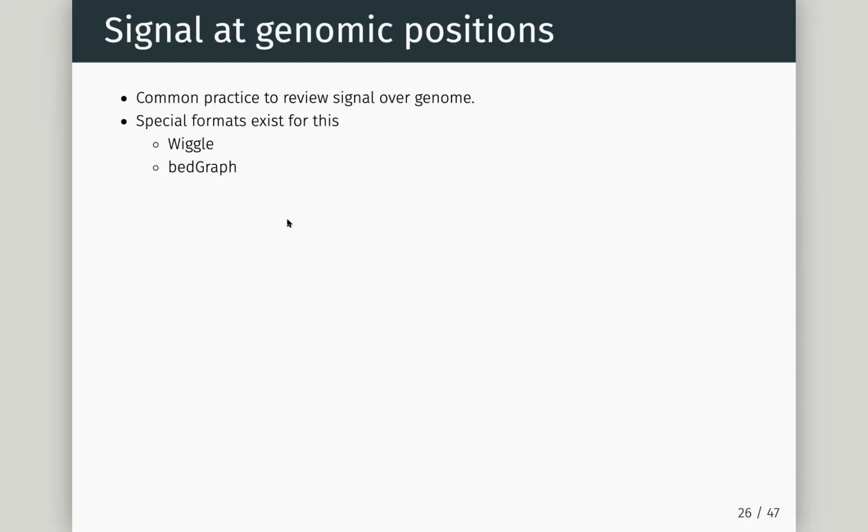Another format which is very, very useful in general is this wiggle format and bed graph format, or at least the concept of these are.